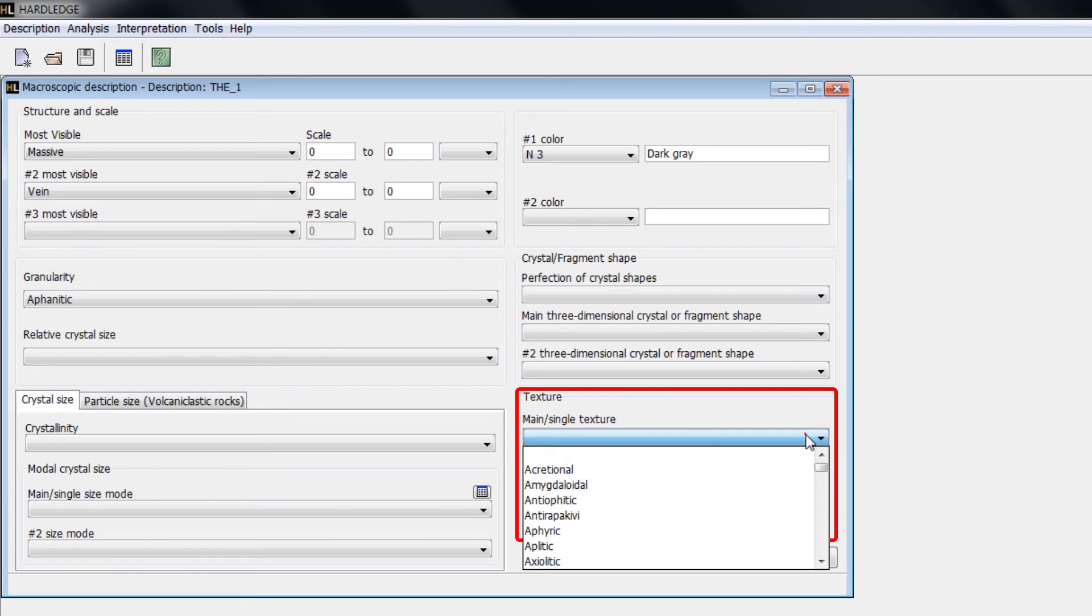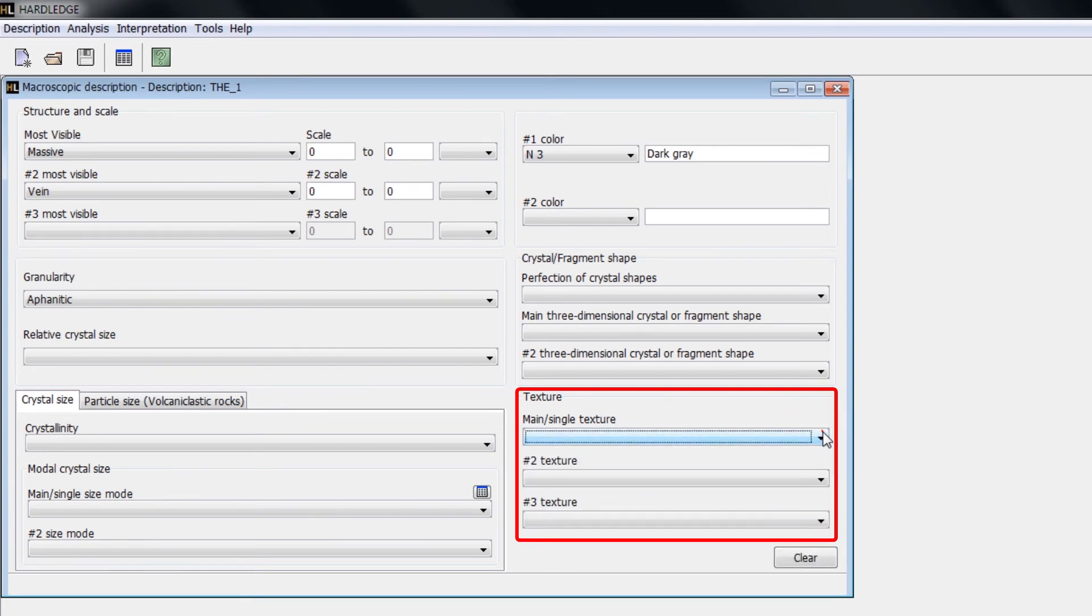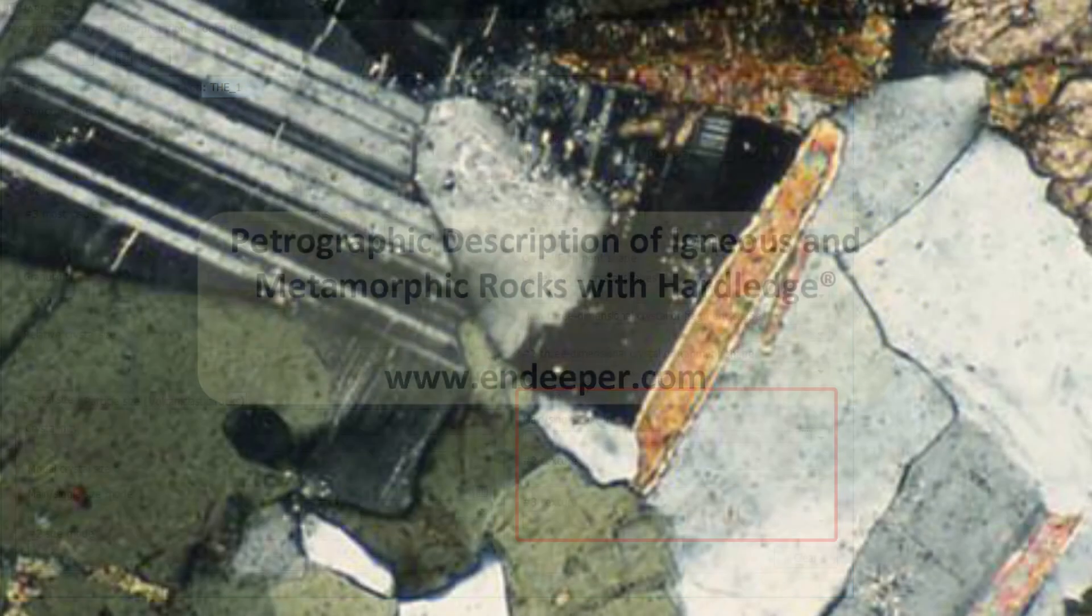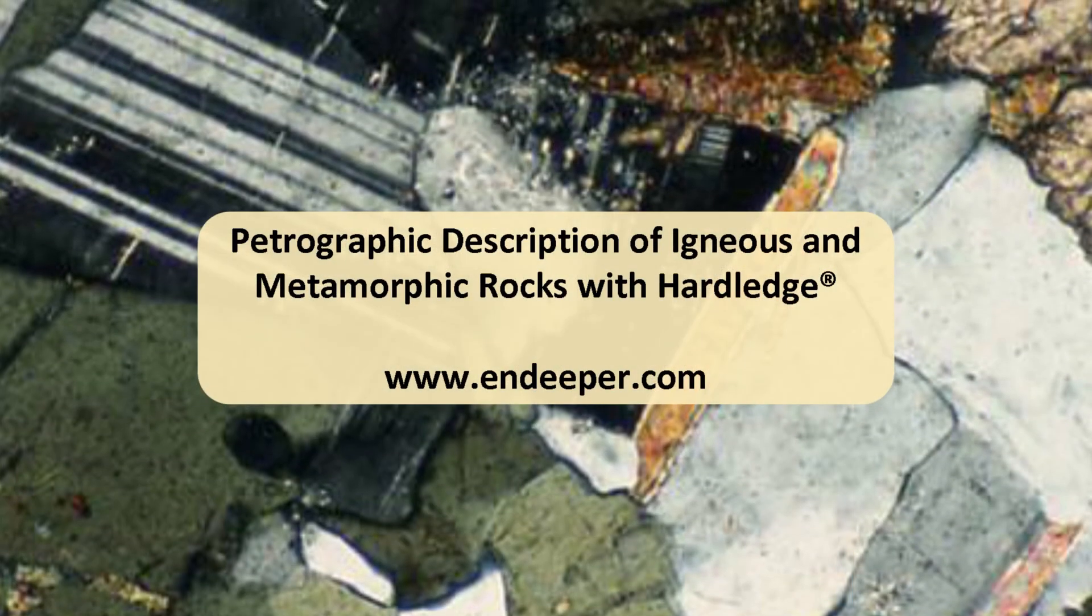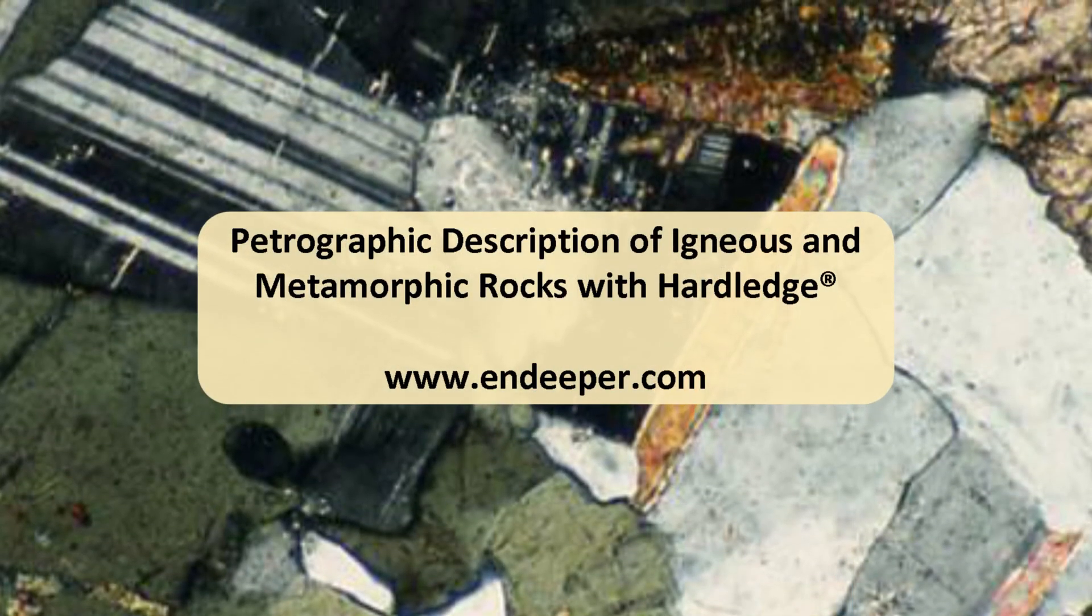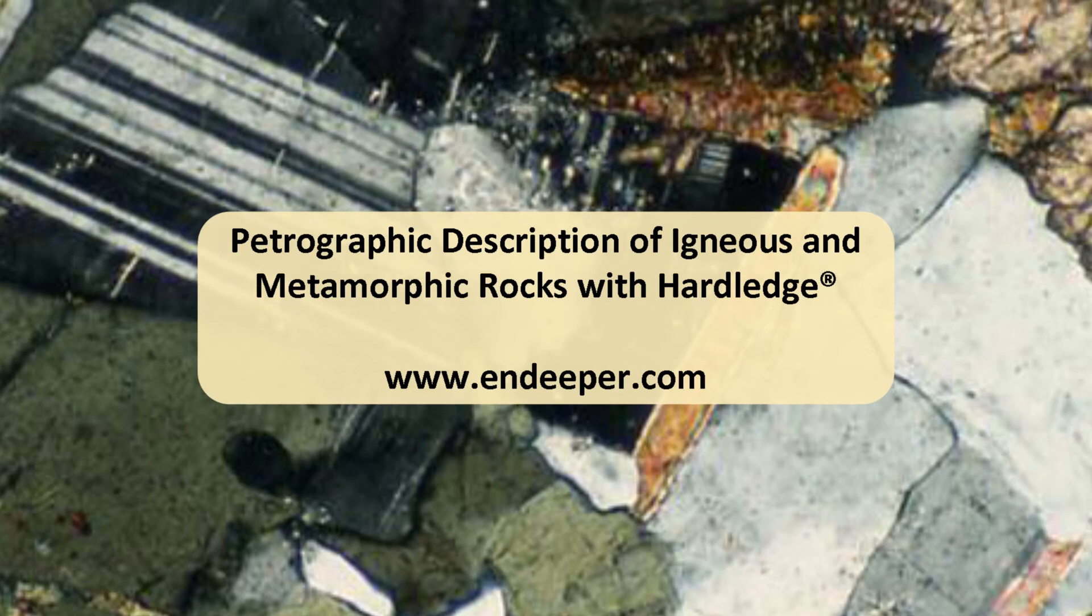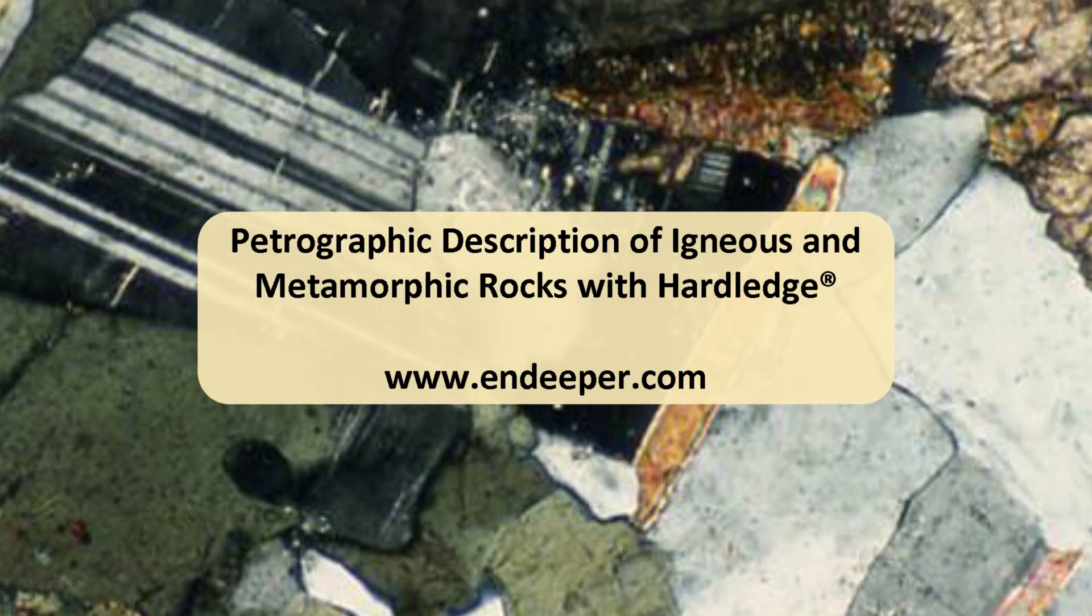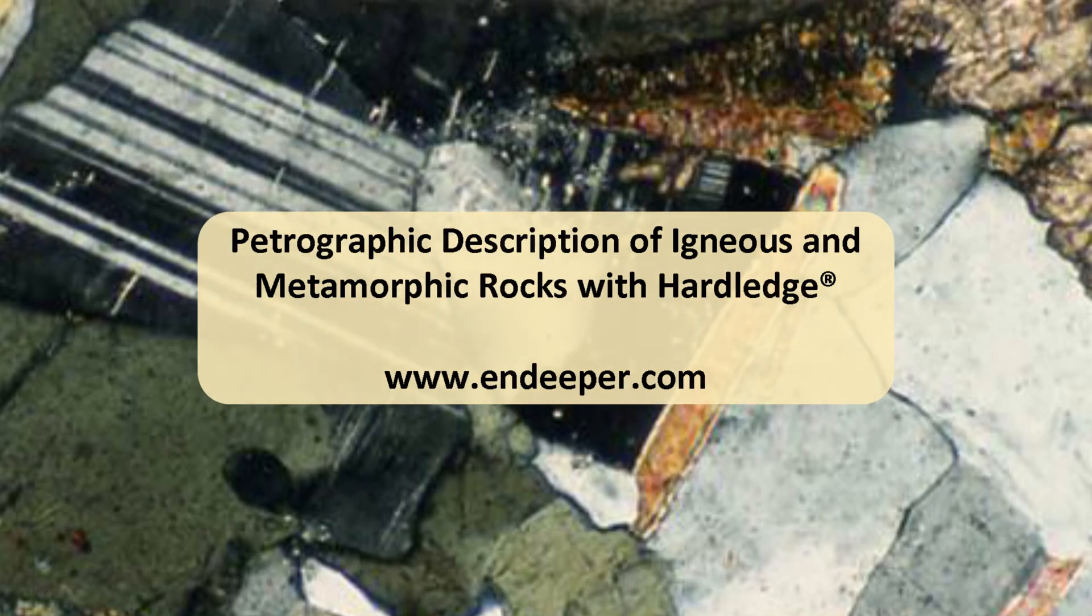In Texture, inform the predominant texture and the second and third most important textures occurring on the rock. For more information, visit www.endeeper.com.